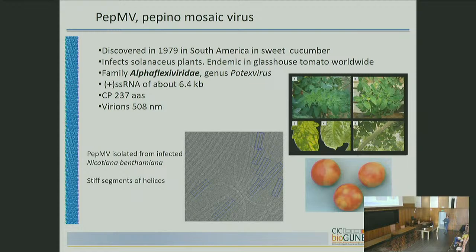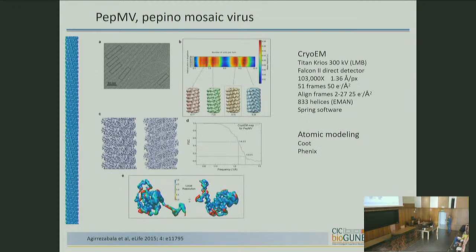So as I mentioned, what we do is collect images in different microscopes. I think this one was at the MRC, because they opened a line for a Spanish researcher. And the work includes testing different parameters in the helical symmetry. You have to figure out the rise, the rotation, the pitch, and the number of units per turn.